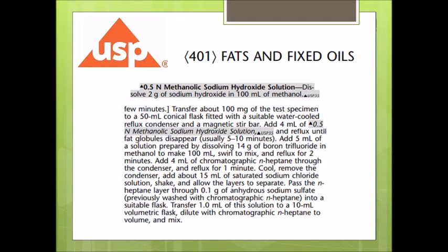of them. You don't have to reflux for certain hours. It's just up to you. I mean, I definitely didn't reflux any of my solutions. I only heat them up to 80 or 90 degrees, and the boiling point of methanol is definitely less than 80 degrees. And also there is a step where you have to pass through sodium sulfate in order to dry it. I always skip that, and I didn't see it as necessary.